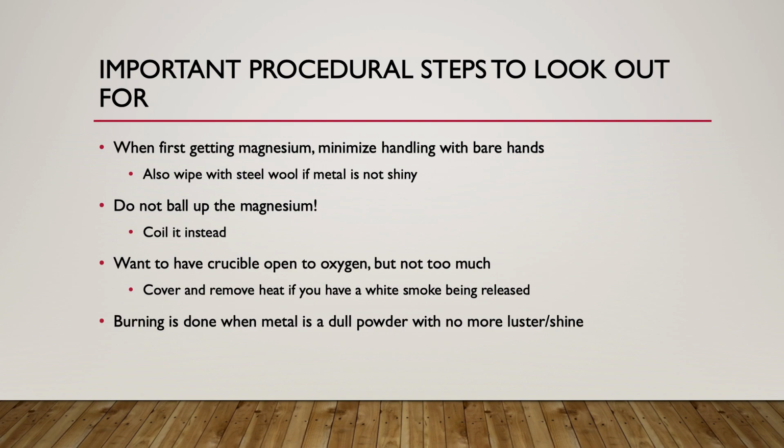If you want to touch it very briefly with the tip of a pen or a pencil, just be careful if you do that, because it might stick to the tip and then you might lose some of your mass that way, so it might throw things off too. Usually if you can just visually look at it and tell it looks very powdery now, it's got a very dull color to it and it's not shiny, that's your main indication.